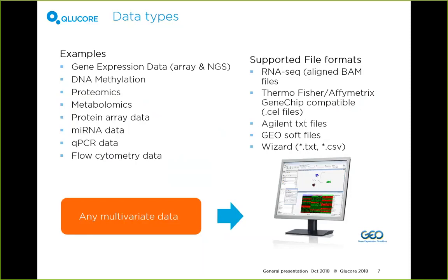But any sort of data can be read into the software by means of, for example, the Wizard, which is our specialized tool for downloading and entering data from a text file, where you can basically tell the software what your data looks like. And we're going to look at a twist of the Wizard today, by the way. Not the data wizard, but the annotation wizard. That's one of the things we're going to take a deeper look at today.